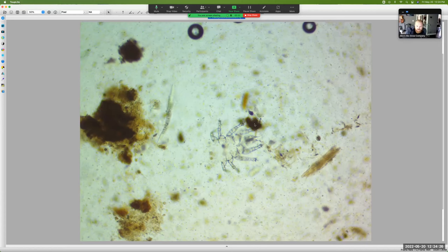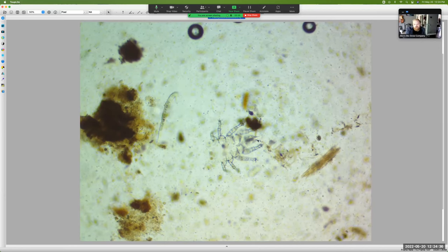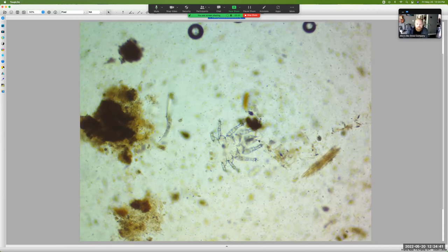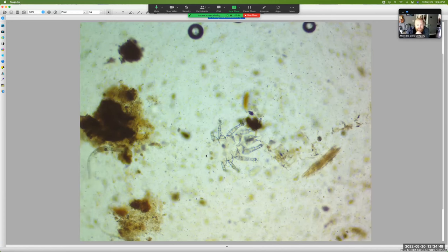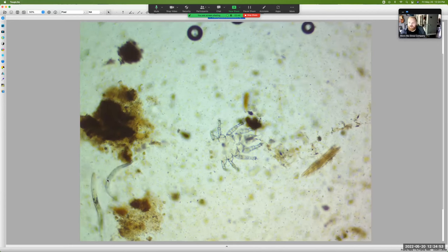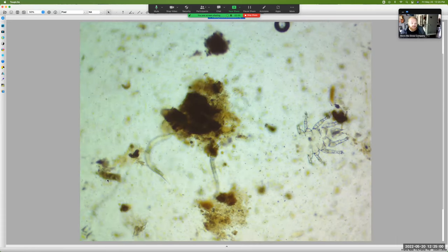Look at that — you can see its arms. It's got four arms on each side and it looks like it's a fungal eater because that's what these big flaps usually mean. They got these big pedi pads or something — I think that's what Dr. Elaine said once. And you've got two nematodes happening here.